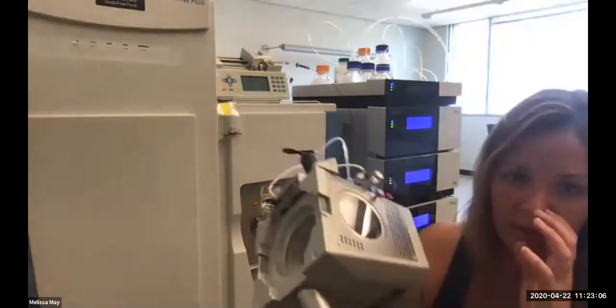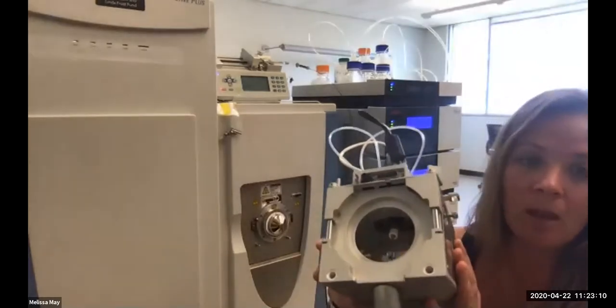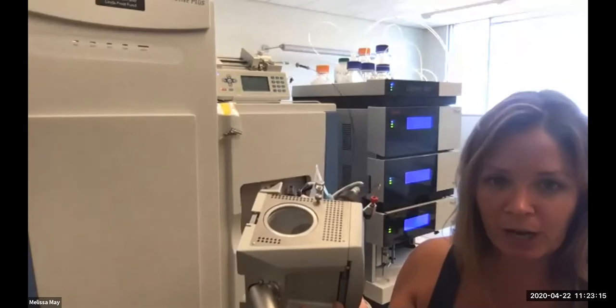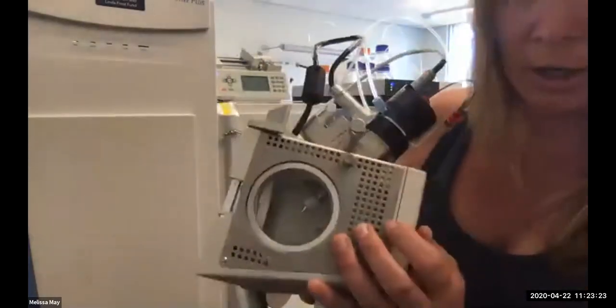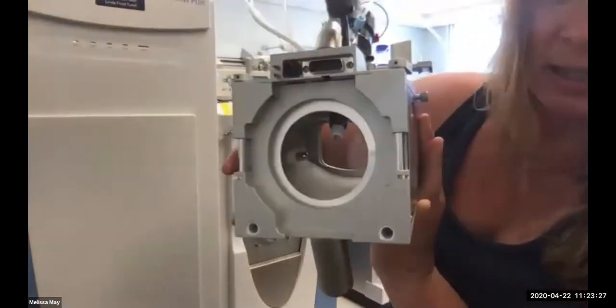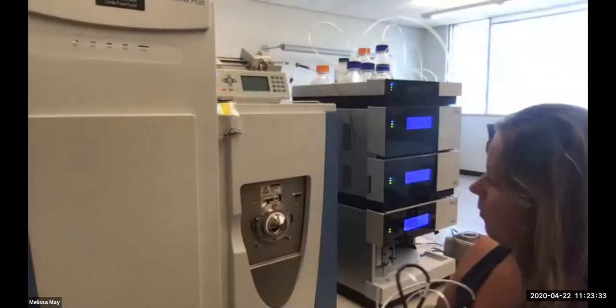So this is the ion source if we're doing higher flow rates. When we're calibrating the instrument, or if we're doing direct infusion, this is the source you'll need to use. You can see that the needle or the probe is rather large, and there are various little spigots in there, hard to see, where gas is being injected in, which helps to set up the flow rate.